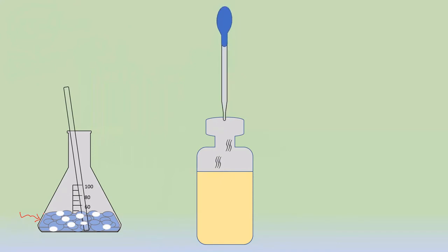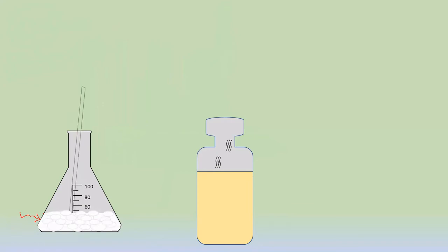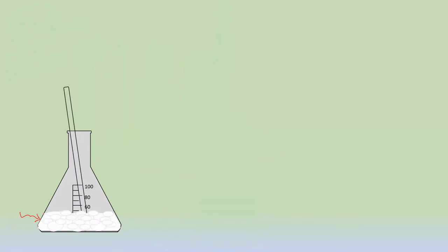Okay, but this step, adding concentrated HCl, you have to do slowly, drop wise. As you add it, mix the solution, and see that there is complete acidification. How will you see that there is complete acidification? Go on adding and check whether you are getting more and more solid formation. Now you can see the solid formation is complete. The entire solid has come out, that means it is complete. If you add more concentrated HCl to that solution, observe whether it is giving more solid or not. Or you can check with pH paper also. We are supposed to acidify the solution, so your pH paper should turn red.